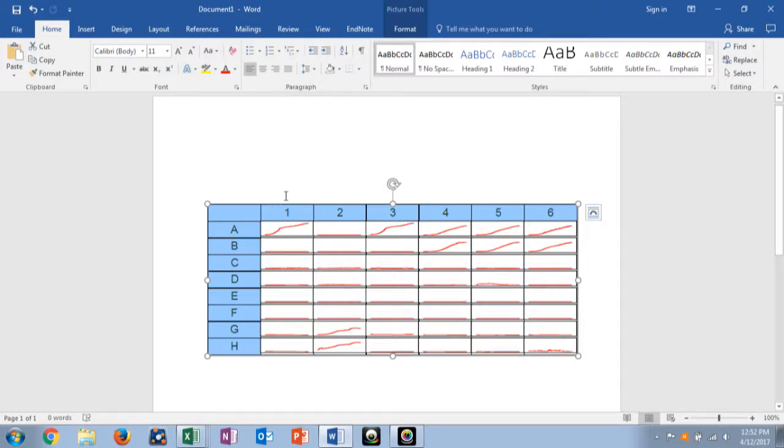So one thing to remember is that each of these columns represents a different thing that you were testing, be it a different treatment or a different bacteria using the same treatment. So remember that each of those is a different condition. That's what you're looking at. So each column is a different 8-well strip. Each of these is a different well in the 8-well strip. So A through H, there's 8 of these. So 8 wells, 8-well strip going down.